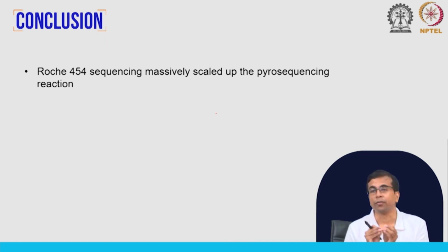In pyrosequencing you have sequencing by synthesis, which means you are synthesizing the complementary strand of the DNA molecule present on the bead, using DNA polymerase, dNTPs, etc. Once a base is added, whether it is A, T, G or C, there is a release of pyrophosphate, which through a series of reactions is converted to a light signal.